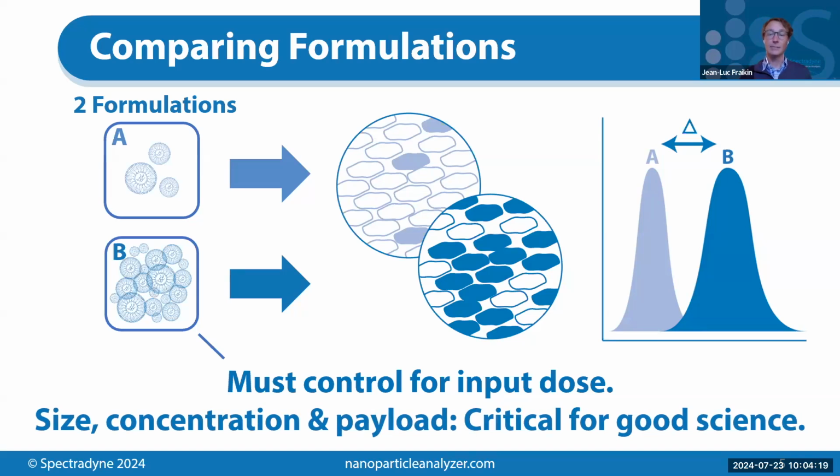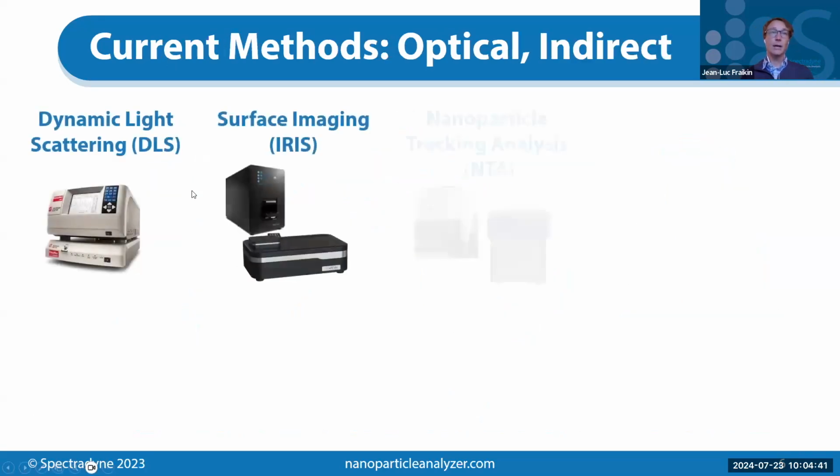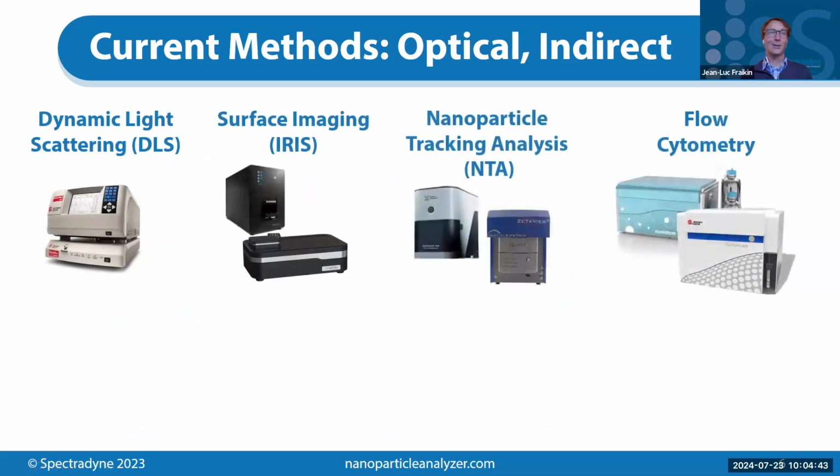There are a lot of technologies out there for measuring the outcome of this experiment, like flow cytometry we mentioned, right? And those are even in approved diagnostics now, which is really cool. But there is a severe lack of technologies that are appropriate for measuring these nanoparticles, the input to this experiment. But there are many available. Okay, so let's talk about those.